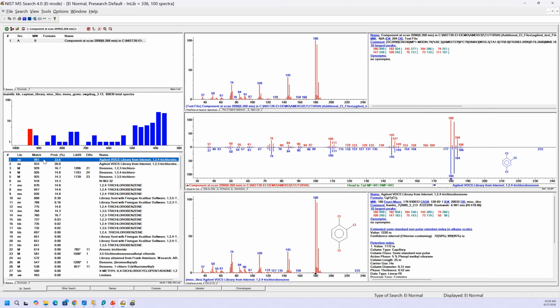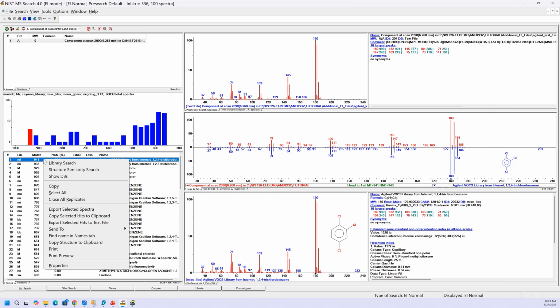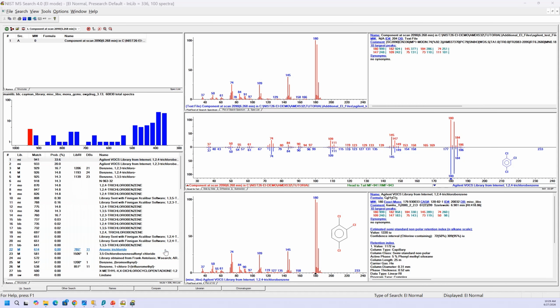Now to send it to ChemSketch, I right click on it and say send to default structure editor. Hopefully you set that up properly when you installed the ACD software, to relate the mole files and associated files, so that anytime it sees them in the clipboard it opens the right application. If not, you might have to take a closer look at that. So I sent it over.